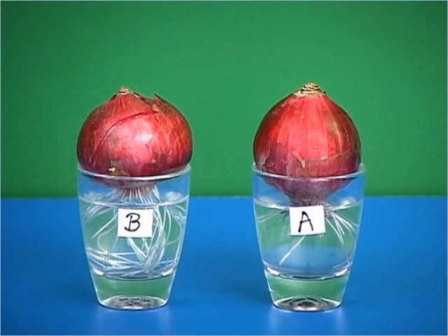From the above activity, it can be concluded that root tip of the onion has a specific type of tissue called meristematic tissue which causes the growth of a plant.